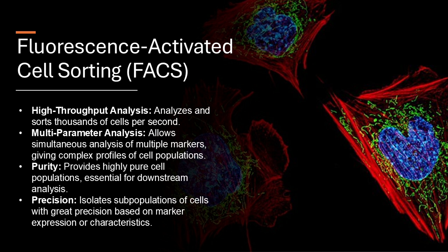So for our listeners out there, if they want to learn more about this technology, where can they go? There's some great stuff out there online, in libraries. The International Society for Advancement of Cytometry, that's a good one. They have tons of information on FACS, educational materials, articles, events. You can also find good videos and articles on websites like Nature, Science, the National Institutes of Health, places like that. Perfect. A great starting point for anyone who wants to dig deeper.